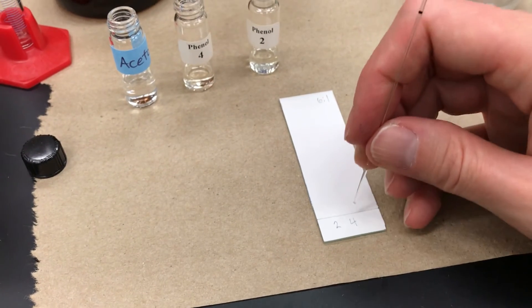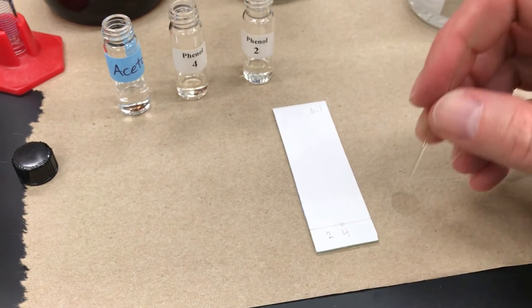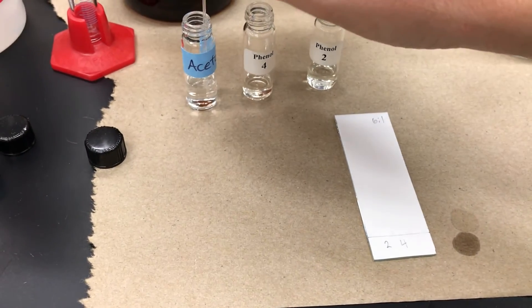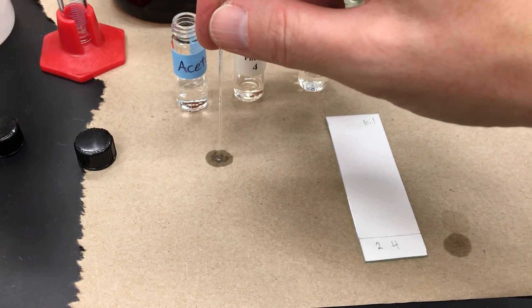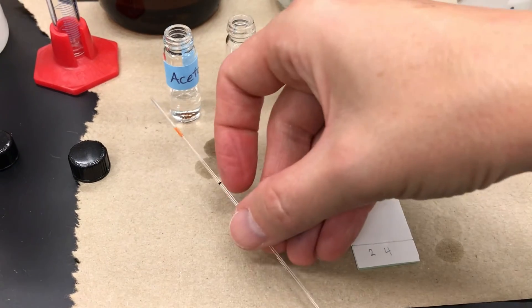I'm now going to also put the same thing in spot four. Depending on the concentration of what you have, sometimes you want to spot it more than once. You wait for it to evaporate on the line. But in this case my concentrations are correct. I just needed one spot.